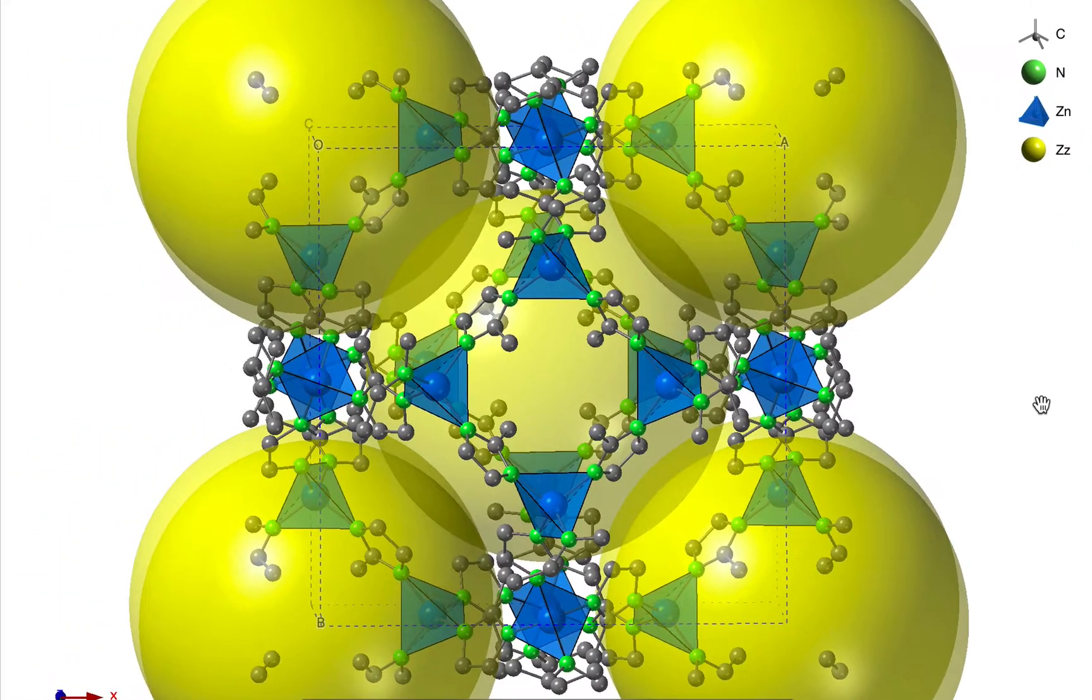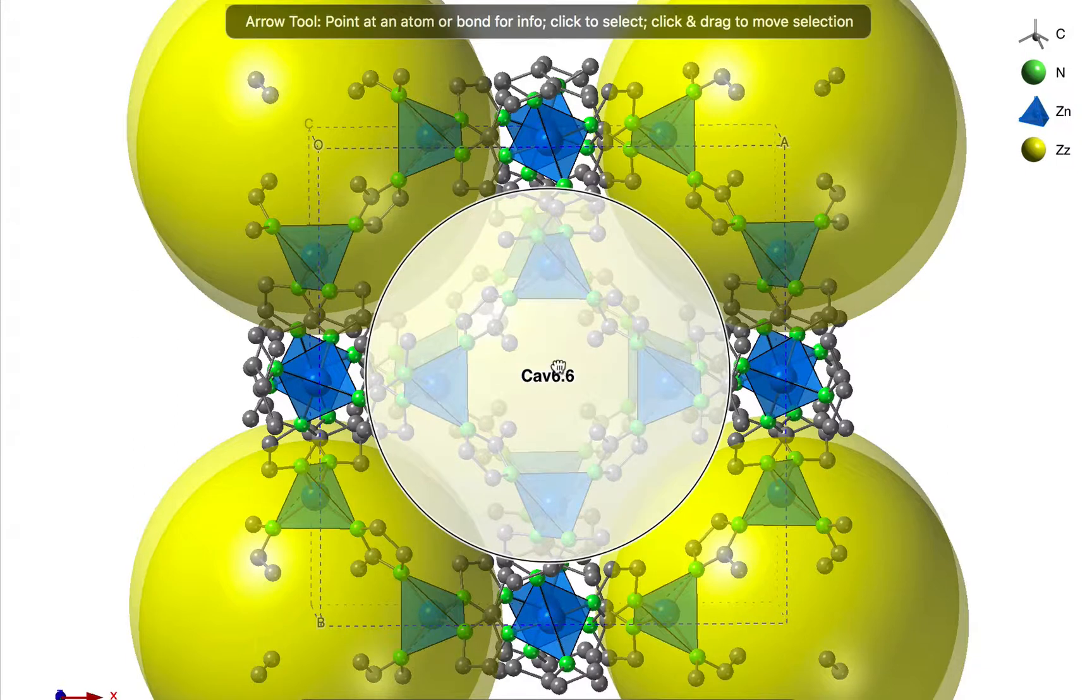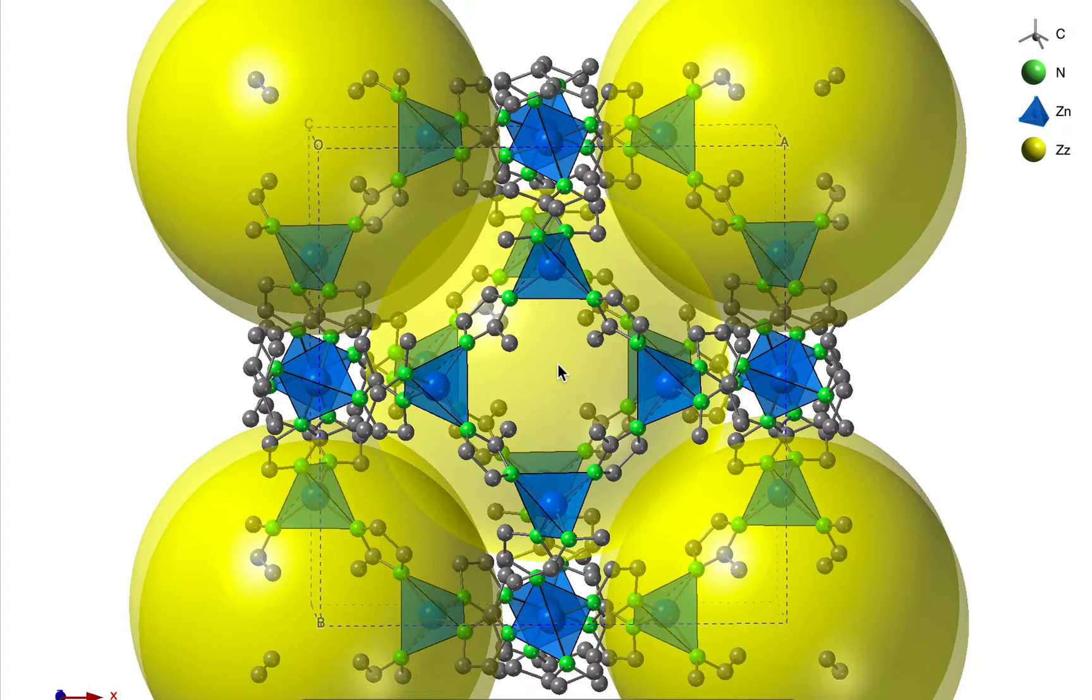Now we have the correct size. The next thing I'm going to do is isolate one cavity and the surrounding atoms. I'm going to use the arrow tool and click on the cavity atom to select it.